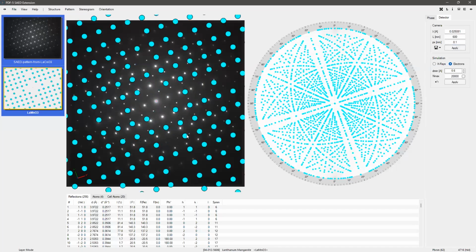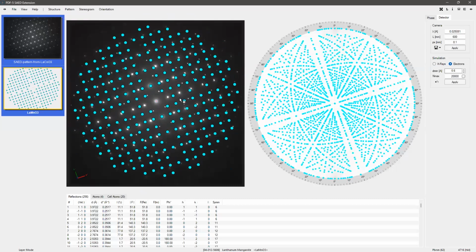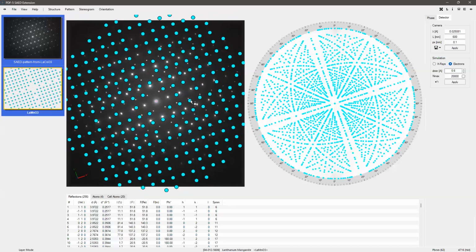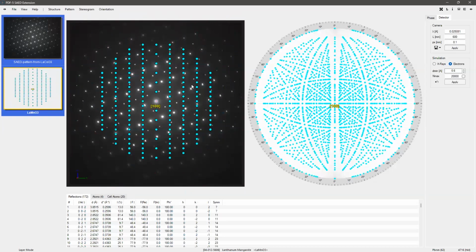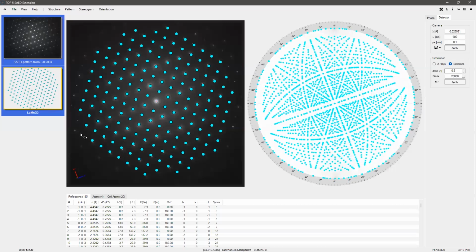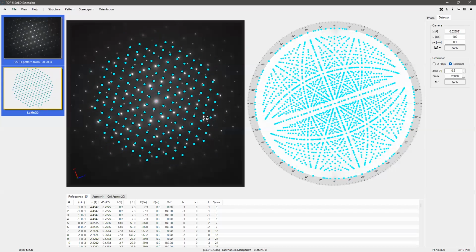This is a downloaded JPEG image with different dimensions, so we don't know what the effective pixel size would be. So what we can do is, I will just use this structure phase, since I know that is this phase, and I will use it as a reference material to calibrate. So from the pattern, I can see that it is probably along one of the major axes, A, B, or C. This pattern seems to match pretty well the B axis.